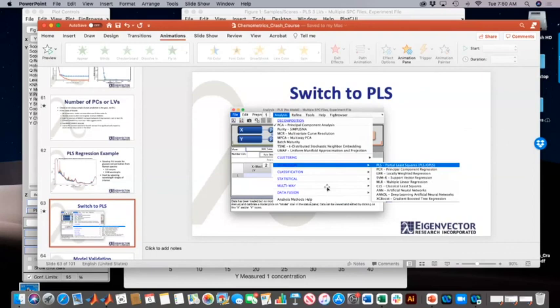Yeah, this is one of those things. It's like, well, should I do my sample selection first and then do pre-processing, or should I do pre-processing first and then sample selection? And it turns out that both are wrong. In an ideal world, you'd optimize all of these things simultaneously. So you do need to go through the process, and there's a bit of back and forth in it.